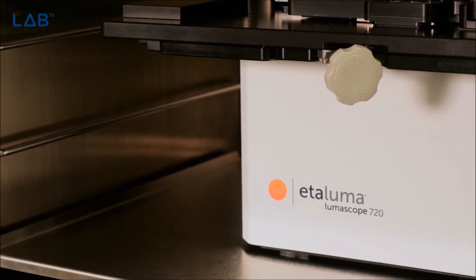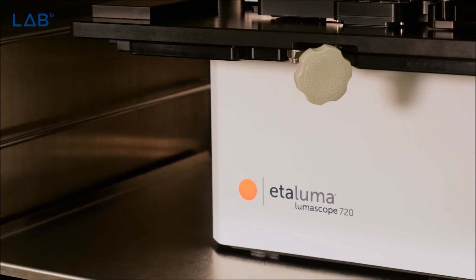The 720 will give us both autofocus and automation in XY, so we can look at many many more fields on a given specimen. This will allow us to potentially get exponentially more data from a given experiment. We're really excited about getting this into the lab and getting some great data.